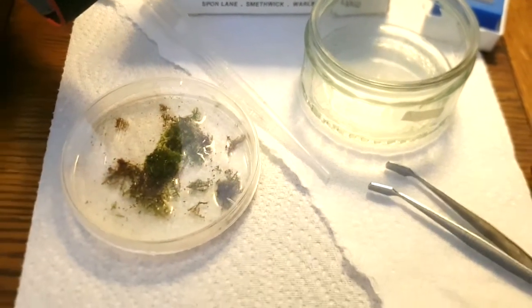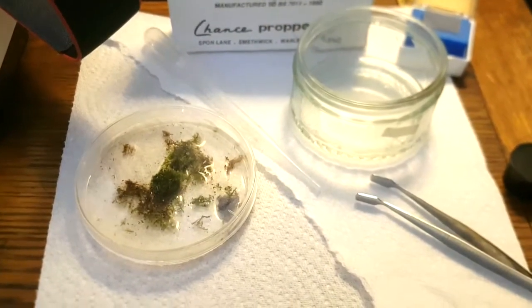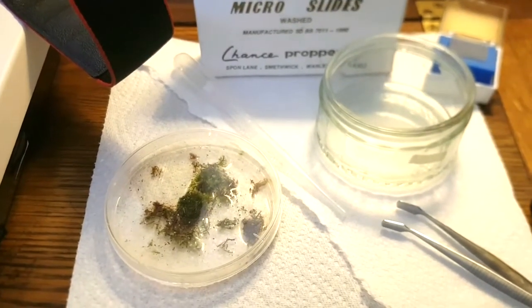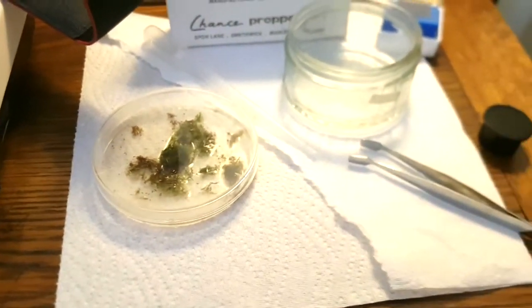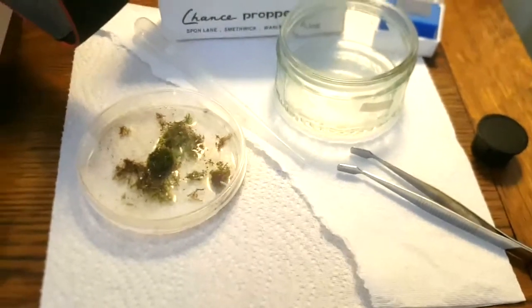So I know not everyone is with me on that one, but it's one thing to accidentally kill loads of microbes when you're going about your daily business, but to study them and get videos of them and then knowingly kill them is just not something that I'm comfortable with. So yep, that's why I have a little wash bucket there. I've got some tweezers so we can shake out the moss as well.